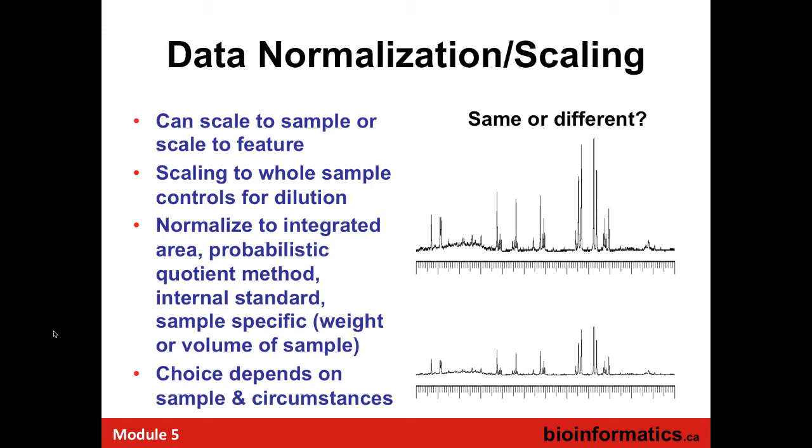Normalization in statistics normally actually means converting something that was a skewed distribution into a normal or Gaussian distribution. So that's a fundamentally different definition, and this is where there's a problem. And then people also use the term transformation to do the same thing, converting a skewed distribution into a normal or Gaussian distribution. So these are terms that are confusing, and they're used in the literature kind of haphazardly, because different disciplines and different fields mean different things by them.